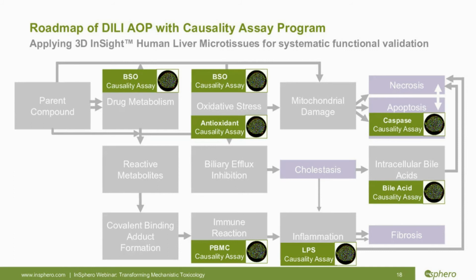specific causal adverse assay evaluation. Monika will show you an example for the reactivity assay, where she is enhancing the sensitivity of a compound in terms of cytotoxicity, and she will also show the effect on inflammation, how that happens under LPS conditions under 3D conditions. So there are a lot of other possibilities where causality assays can be applied.